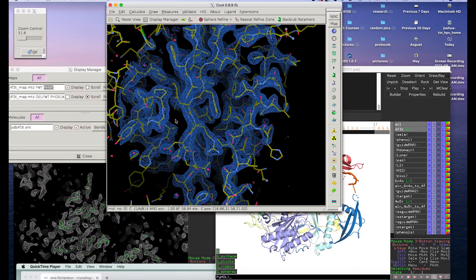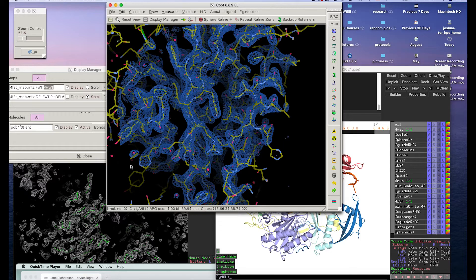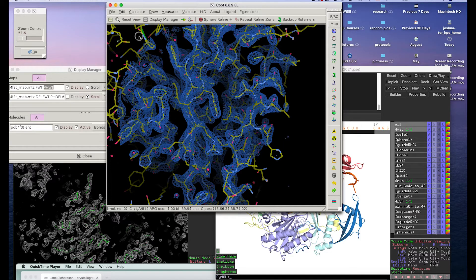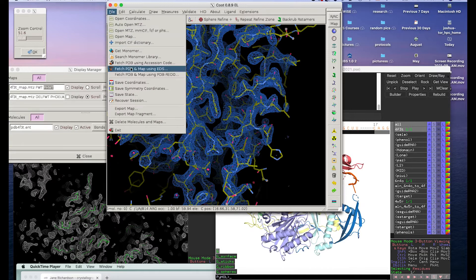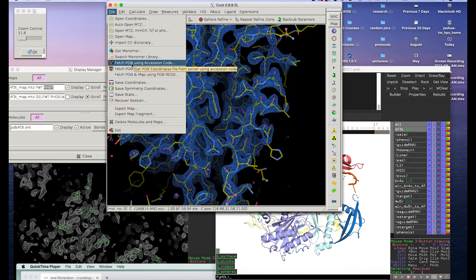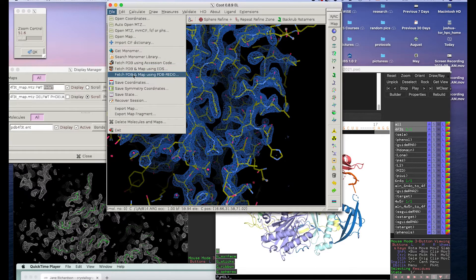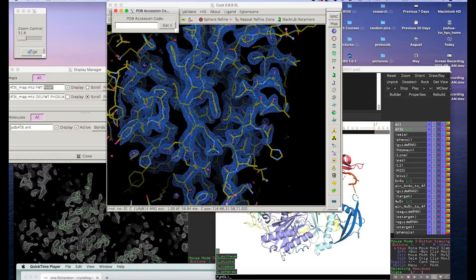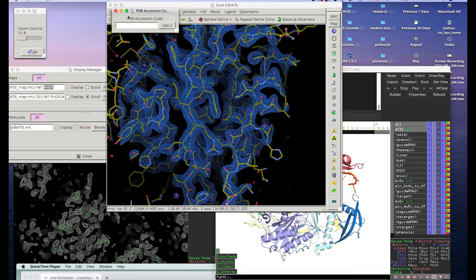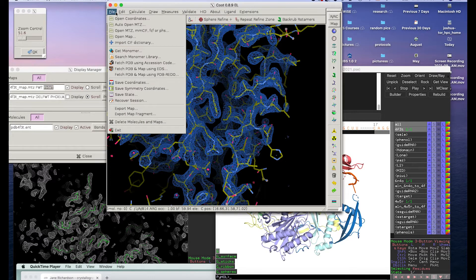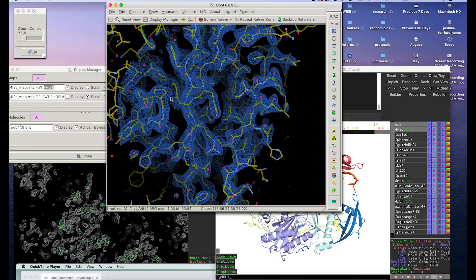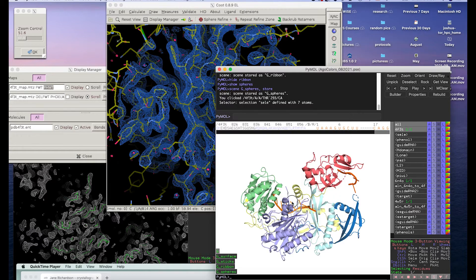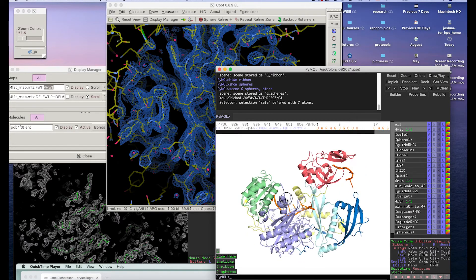If you want to actually look at the map, so right now this is in Coot. If you go to File, Fetch, PDB and Map, then if you put in this, it'll actually download the maps as well as just the structural model.